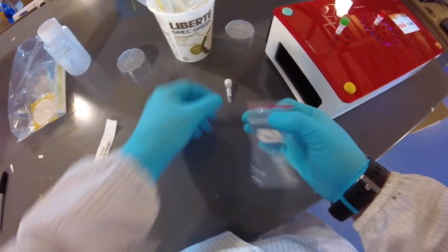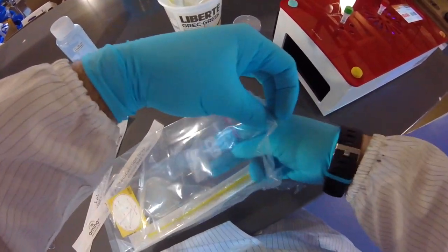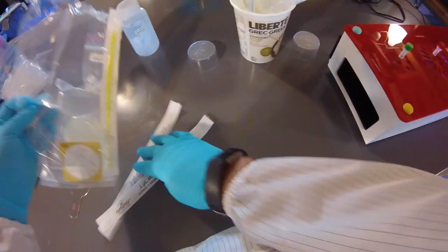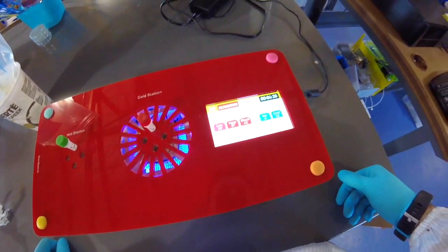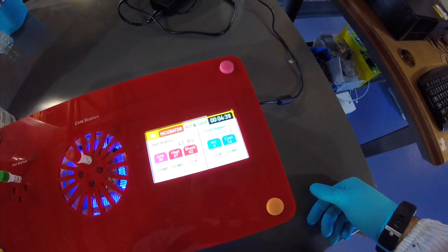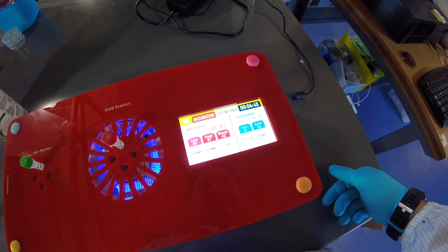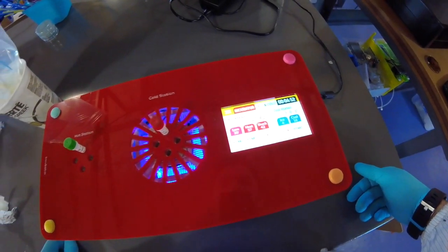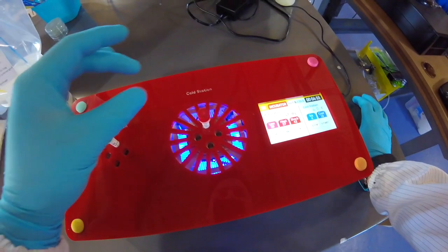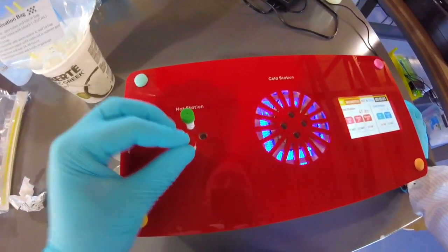Okay, I'm just going to go ahead and put the DNA back into the day 2 bag where it came from. And I'm going to put that back into this bag, which will go back into the fridge for tonight. Move those there. Okay, so we're at 4 minutes and 37 seconds. Temperatures are pretty good. Alright, we're nearing 5 minutes. Alright, so 90 seconds. I just move it to the hot station here.